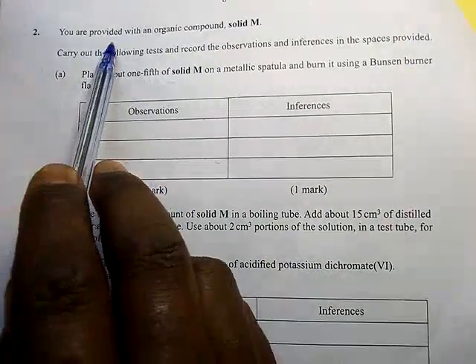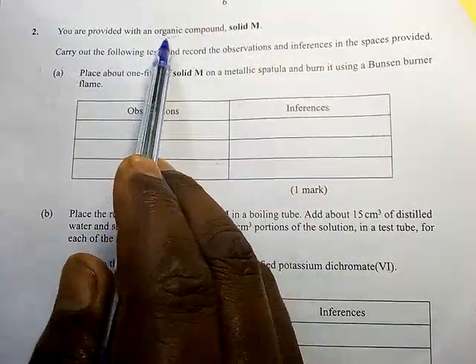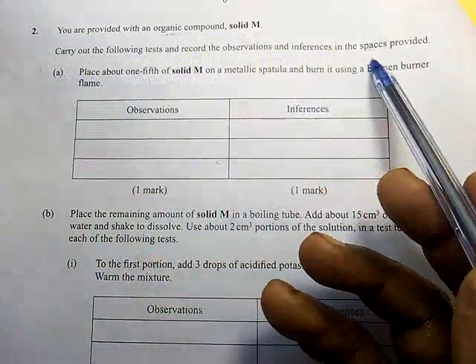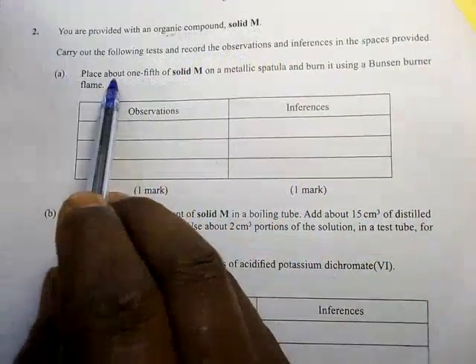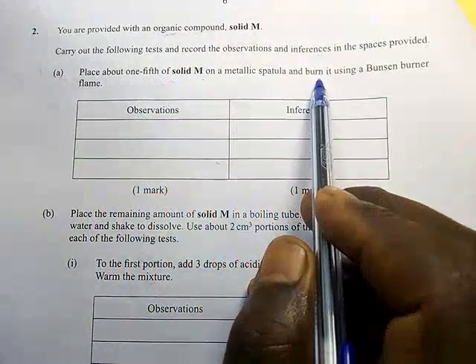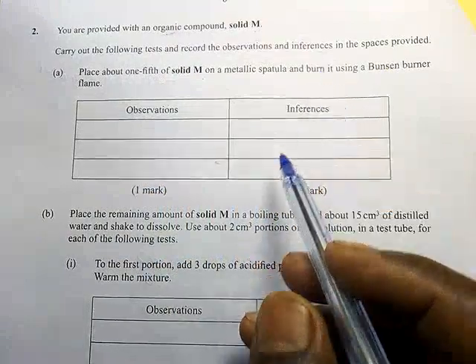Number 2, you are provided with an organic compound, solid M. You have been told it is an organic compound. Carry out the following test and record the observations and inferences in the spaces provided. Place about 1/5 of the solid M on a metallic spatula and burn it using a Bunsen burner flame. So what happened?